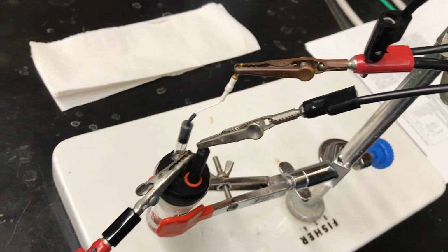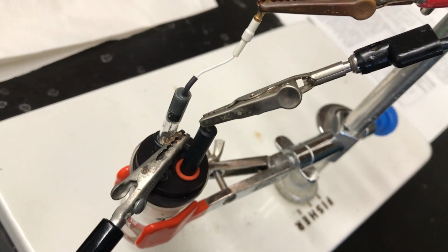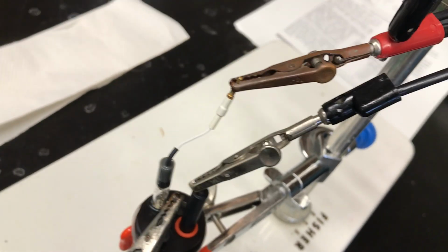Now the final thing that I want to make sure of here is that nothing is shorted. I want to make sure that I don't have any wires hitting other wires, okay? Because a short could be devastating to the experiment. All right, so it doesn't look like I have any shorts here. Everything seems to be properly connected.